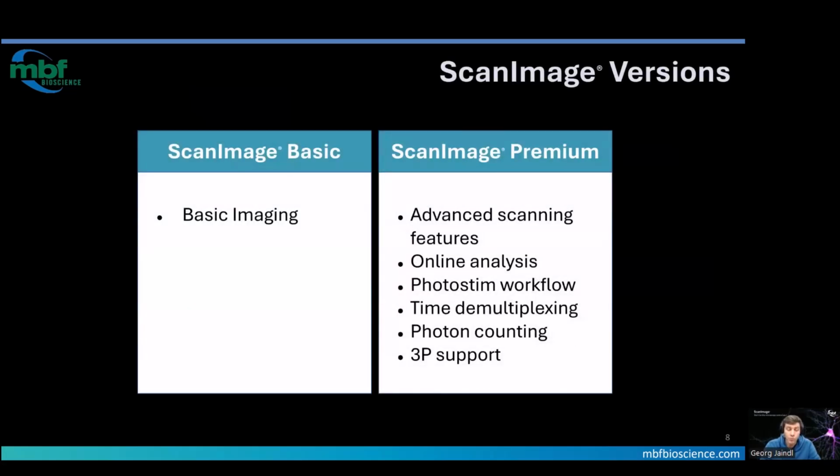There are two versions of ScanImage. There's ScanImage Basic, and ScanImage Basic gives you access to basic imaging. So you can do resonance scanning, for instance. You can control a stage. You can acquire Z-stacks, things like that.